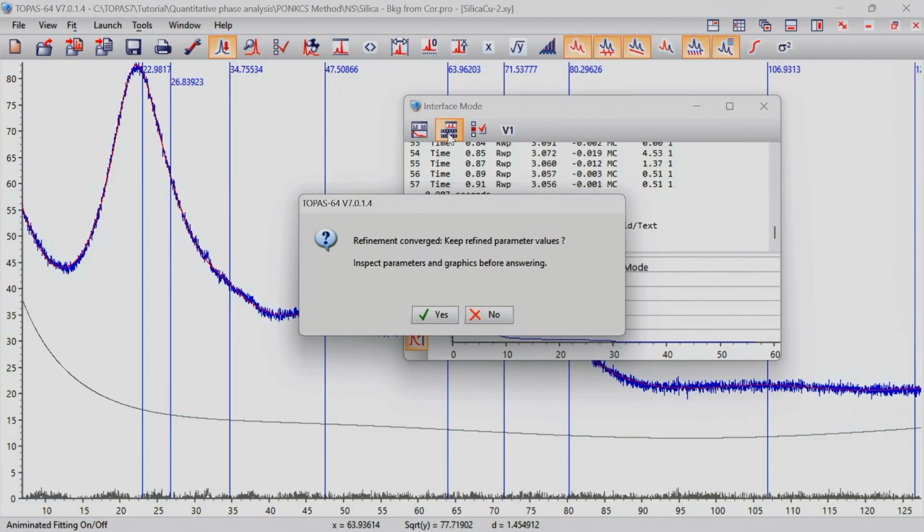So we cannot use the amount directly. First we need to parameterize it, and then we will use the PT amount. If you want to do this in the context of the Rietveld methodology, then you have to model it. You could scale the observed data. That is the so-called pattern matching approach.